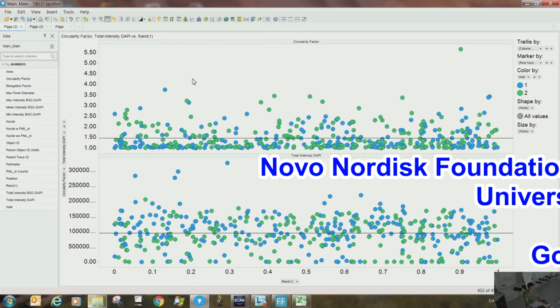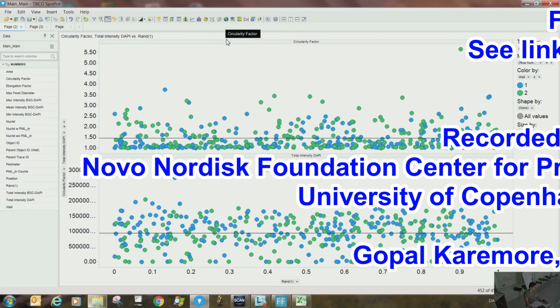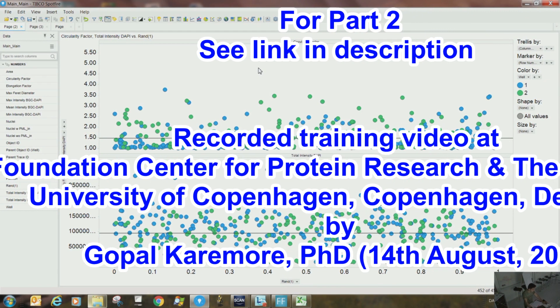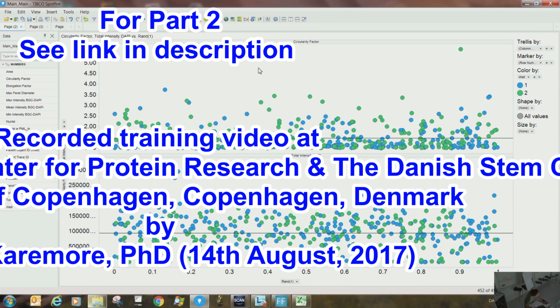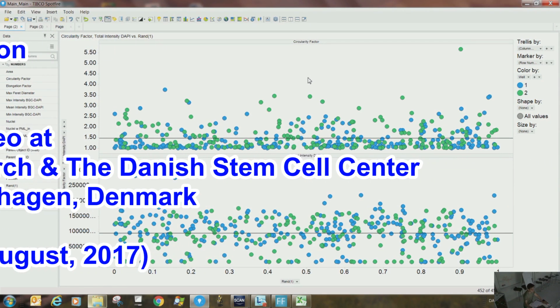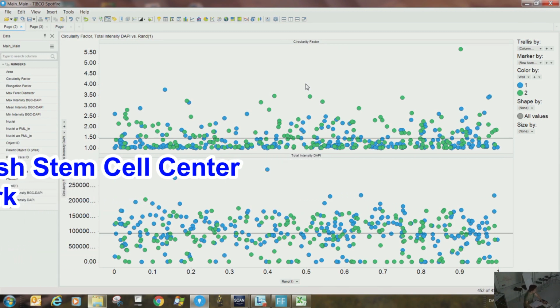Now the interesting thing is all the fancy charts and plots that we can extend. For that I have data, basically an siRNA screening, on I think around 7,000 genes, and I will give that example. But I think we should take a short break for this, like 5 minutes or something?